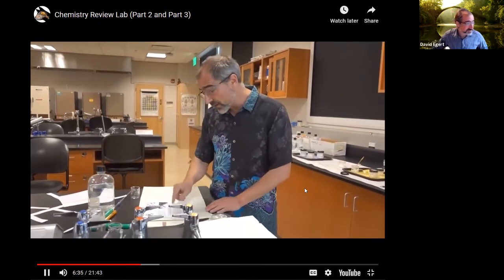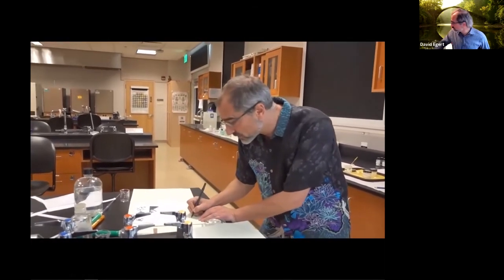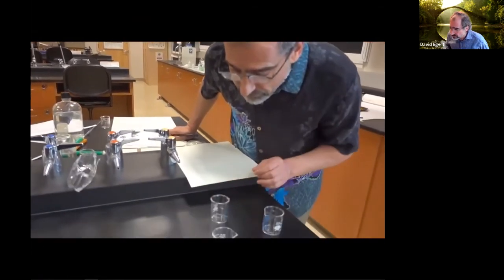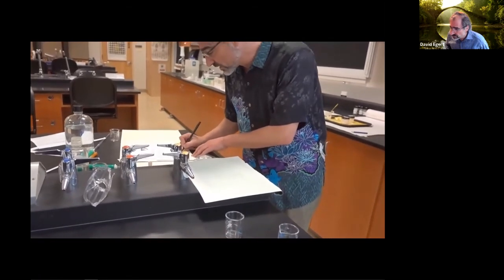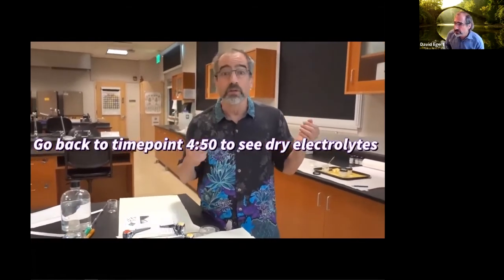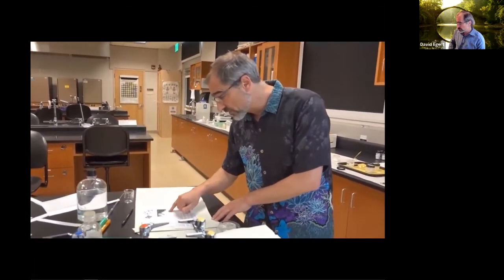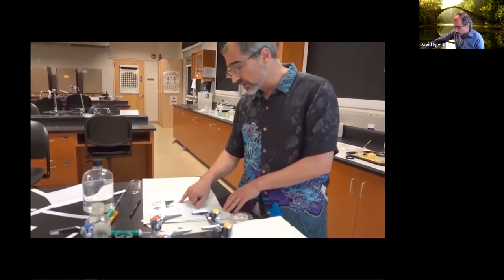Now it says, after I've actually looked, I would write down, again, KCl. In fact, I'll look at it. It's white, fine grains, etc. I'm not going to spend all the time doing it right now, but you would if you were here. Then I'm going to add water. It says add 5 mils of distilled water to each beaker and then swirl the contents.